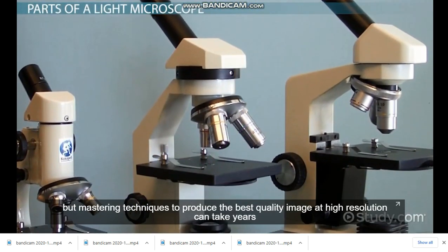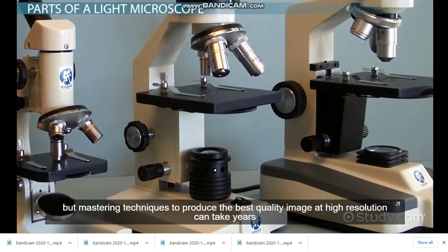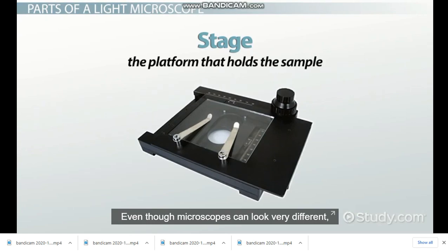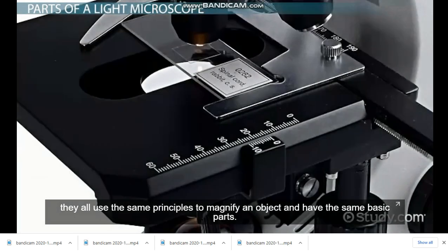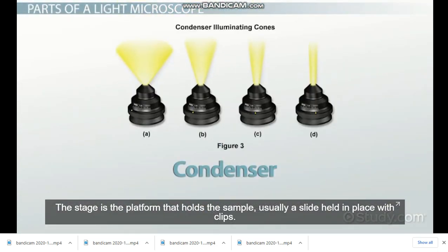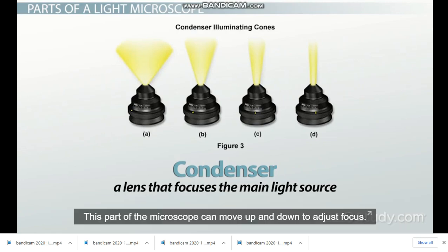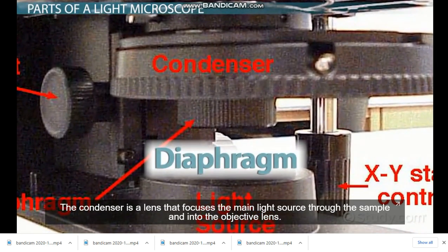Even though microscopes can look very different, they all use the same principles to magnify an object and have the same basic parts. The stage is the platform that holds the sample, usually a slide held in place with clips. This part of the microscope can move up and down to adjust focus. The condenser is a lens that focuses the main light source through the sample and into the objective lens. The user can adjust the light focusing with the diaphragm.